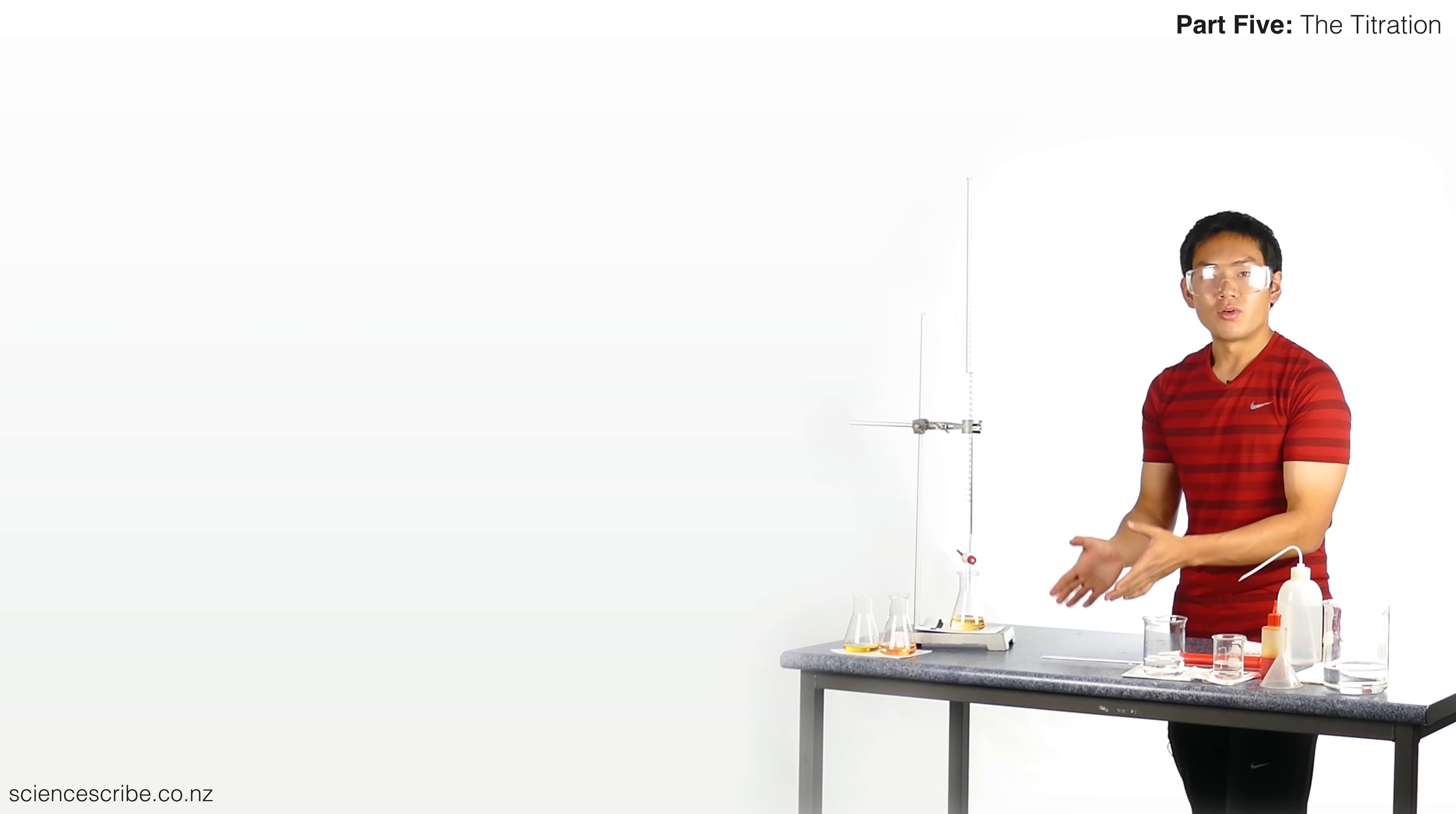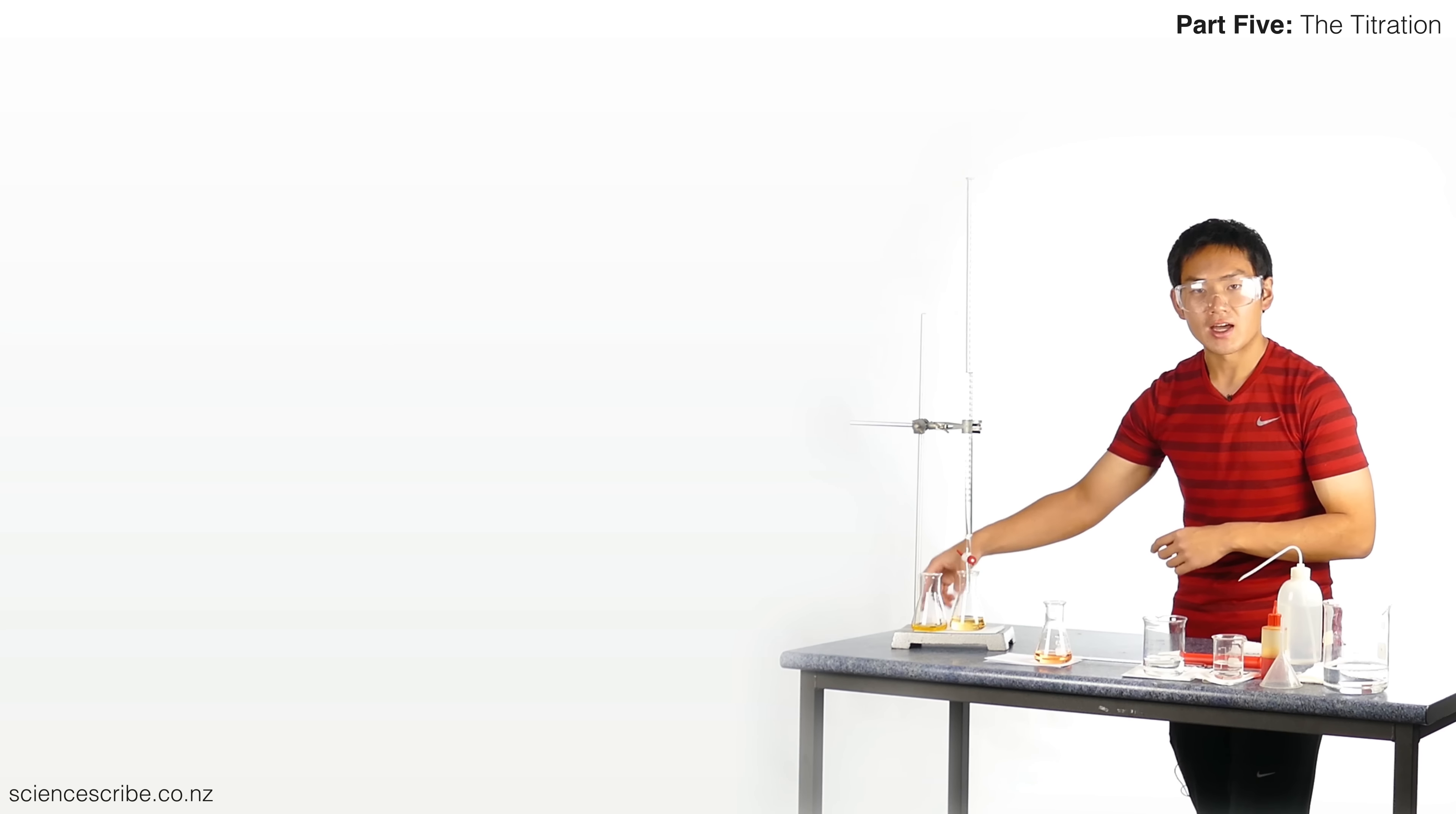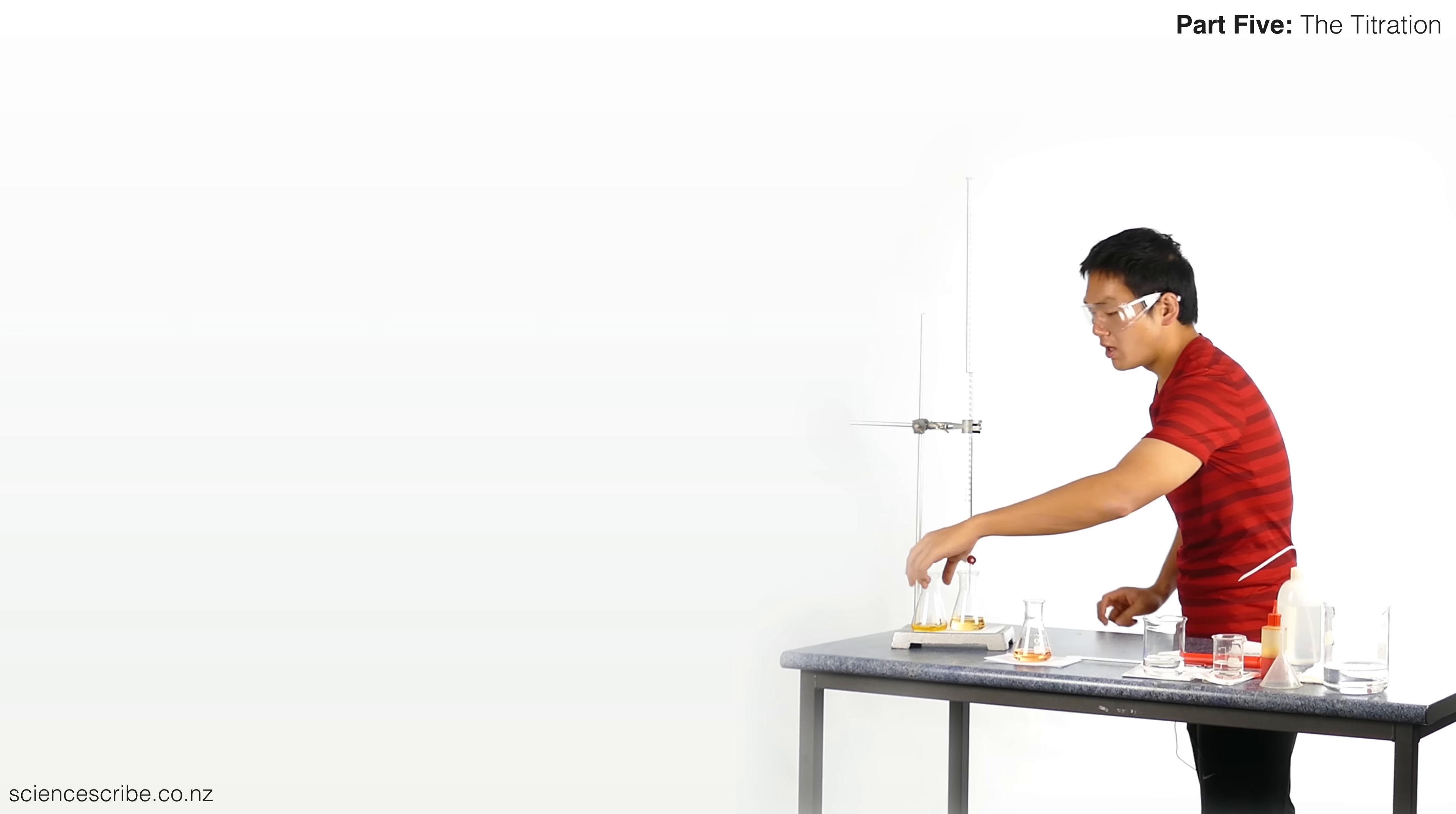That is our endpoint, and I know it's my endpoint because I've got these two flasks to compare it to. I've got my original yellow—that's what it would look like, that's the shade it should be if I hadn't finished. This is the shade for my rough titration. That's the shade it turns to when I get a little too much onto the pink side.